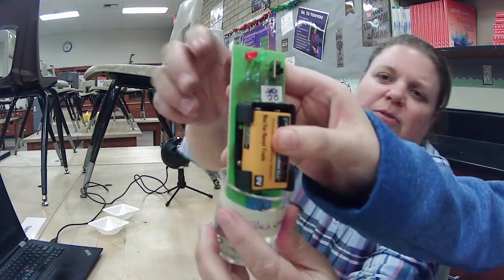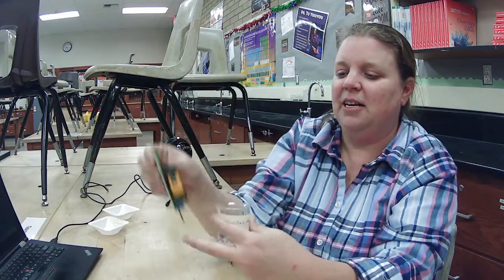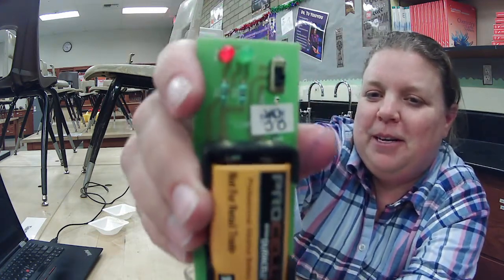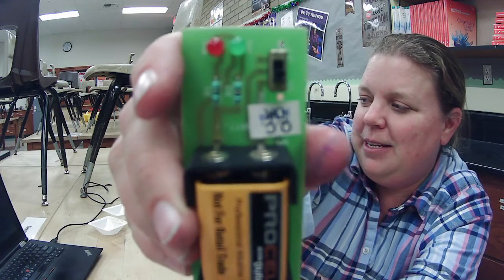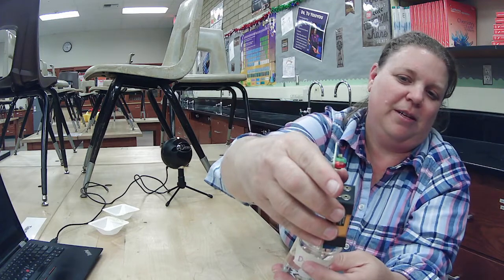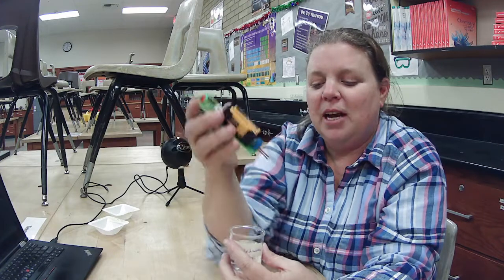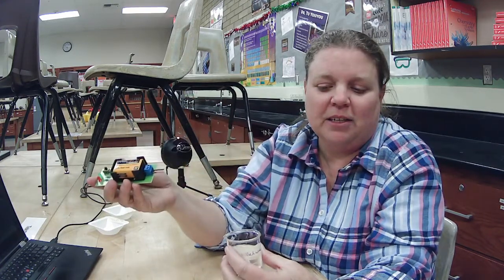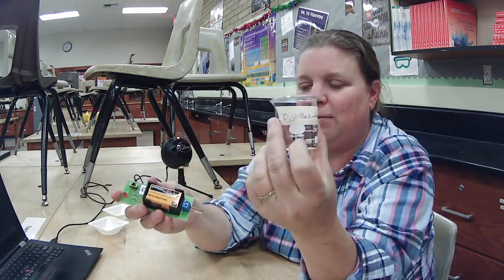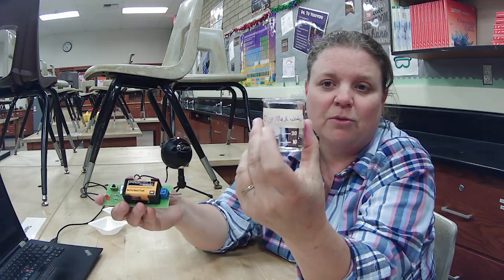If you notice, it's very dim. I'm going to put it up to the camera. It's super dim, so you can see it goes on and off. Do you see that, Josie? See how dim it is? It's not dead, the light is just dim. That means it has a very low conductivity, and that's because there's not a lot of impurities in there. It's mostly water. If I had deionized water, all the ions are removed, and you should see no conductivity at all. All right, Josie, go rinse that one.